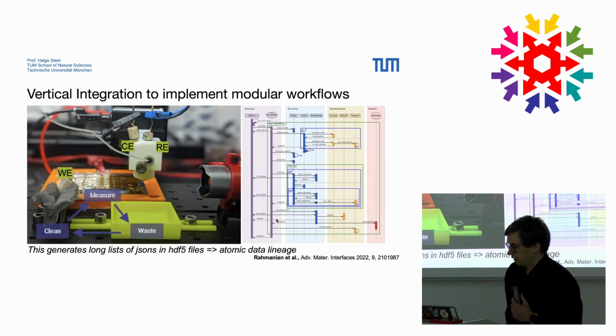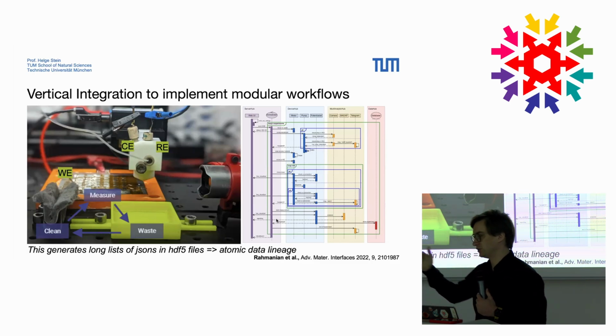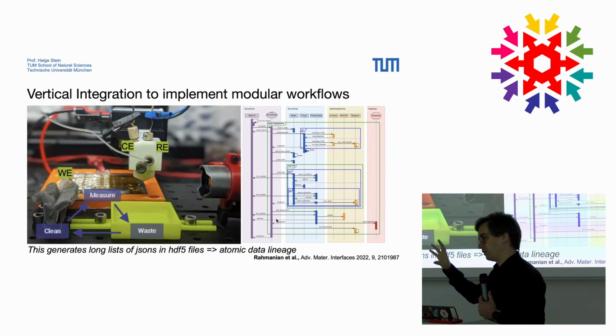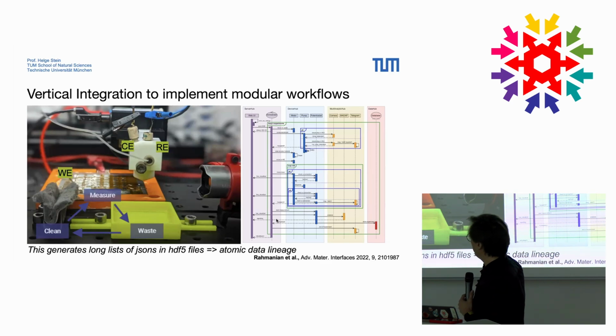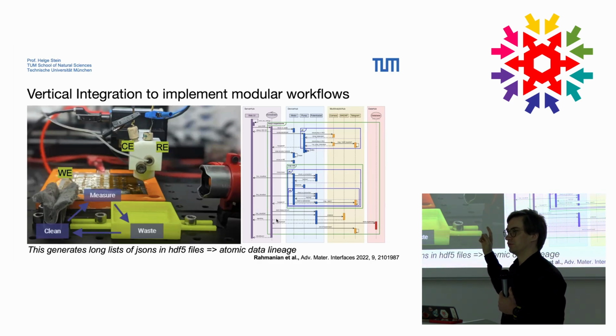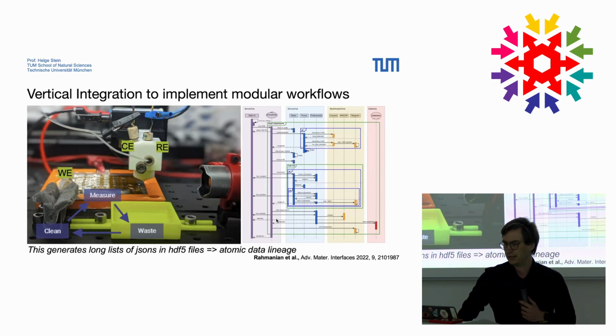What we can do here is, because we go with this approach of having essentially small web servers and a sequence of actions, we can go in and just say, okay, today I want to hook up a webcam with maybe some object detection together with a motor and a potentiostat. What I want to run here is sequential experiments for whatever battery materials, analyze them in real time, and act upon newly incoming results, which I think is super cool.